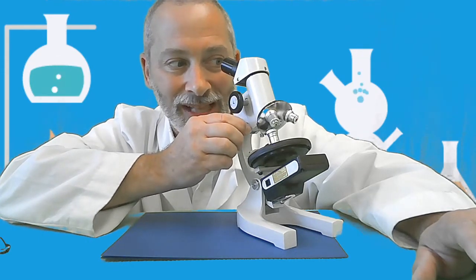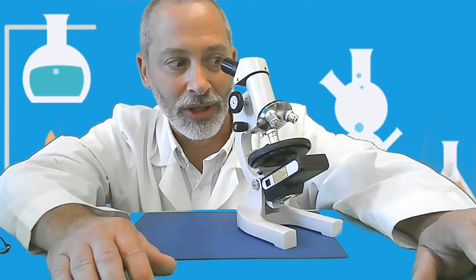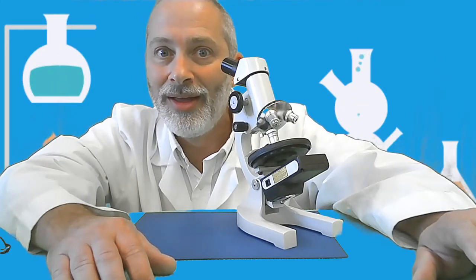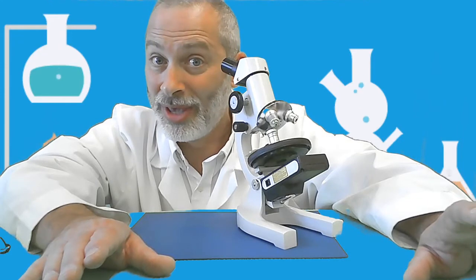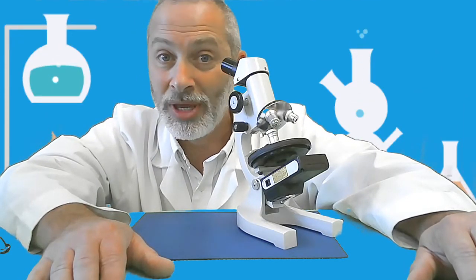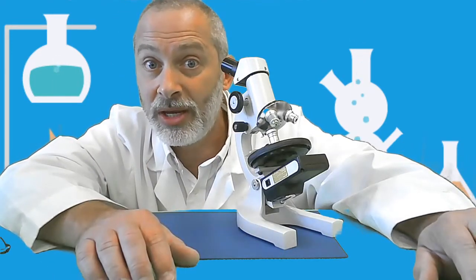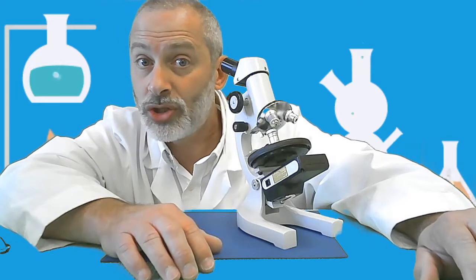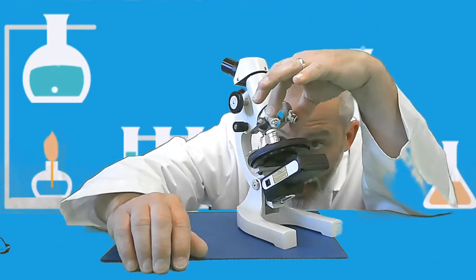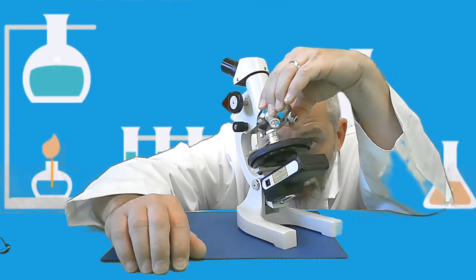Wow, everything is a lot bigger now. A lot bigger. I really zoomed in going from low to medium power. And now, in order to complete our lab and to make some observations for you to record, we're going to zoom into the high power. Now again, it's in focus on medium power. Do not touch the coarse adjustment knob. Use the nose piece lens. Watch from the side just to be sure and rotate.